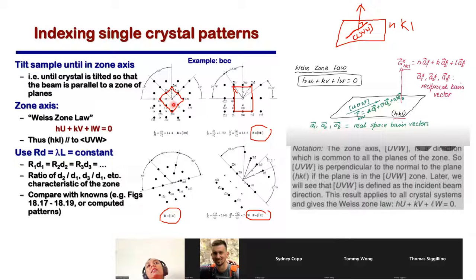that this is coming from a particular family of planes. It is coming from a particular family of planes, but because of polycrystals, there are so many families of planes which are aligned in that particular direction. So what is happening here is, if you join only the points that correspond to M, this one I will just join. So this point here is giving me a first D.